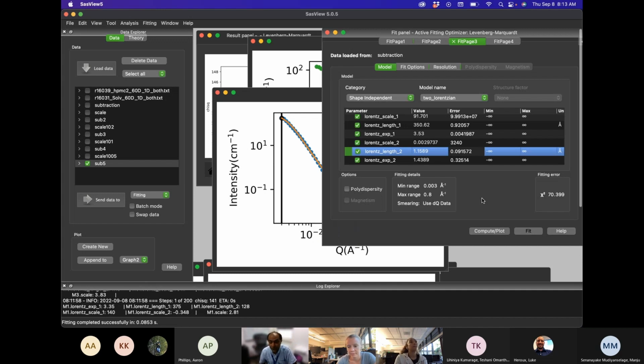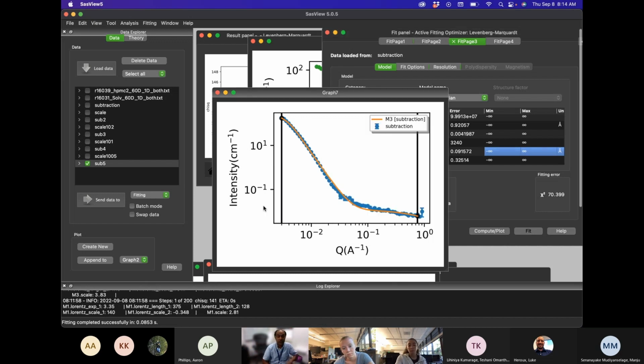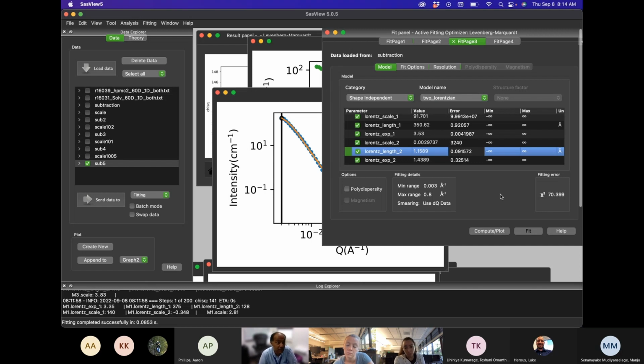But if there is a single Lorentzian function, what you could do is simply copy those parameters for the Lorentzian 2 into that and see how that function shows up. That'll give you a visual idea of where the peak of the Lorentzian is, where the slope is coming, because basically this Lorentzian is coming down like that. It's the curvature of this shoulder. Instead of being an exponential fall, it's sort of a stretched fall, right? For a Lorentzian, that's what is happening.